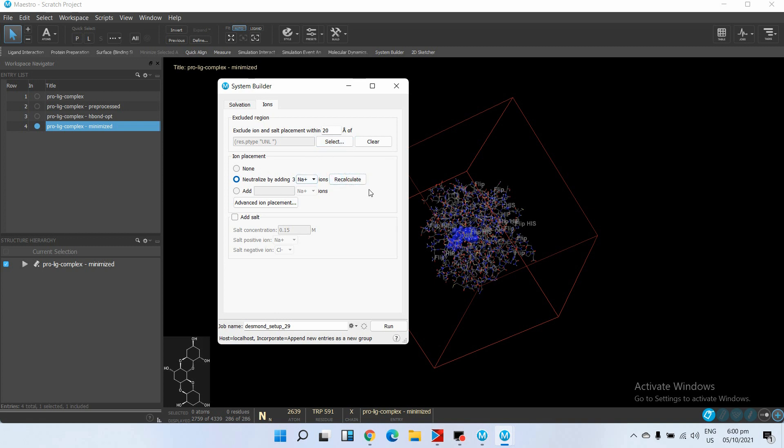Then just click on Recalculate. In order to neutralize the protein we have to add some positive ions. And then to mimic the physiological environment we just add 0.15 molar of sodium chloride.